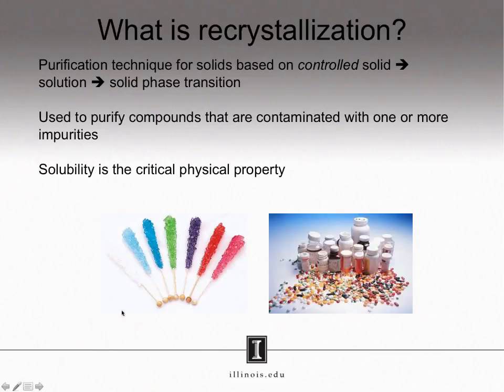Of course, we wouldn't be talking about recrystallization if making rock candy was all it was good for. Most of the solid pharmaceuticals on the market today, such as you see here in the bottom right, are purified using recrystallization. Even pharmaceuticals as common as aspirin are purified using recrystallization.